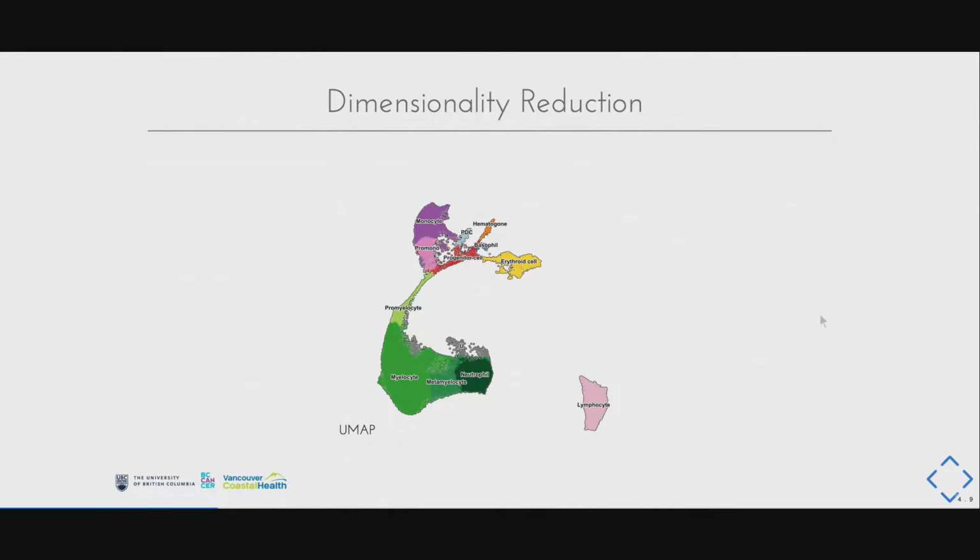Next, we will discuss dimensionality reduction, a very practical data visualization method. I believe you have already seen this UMAP or t-SNE plot many times. But in the next slides, I want to provide an intuitive way of understanding the concept and pitfalls of these dimension reduction algorithms.